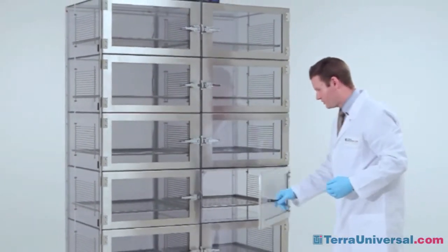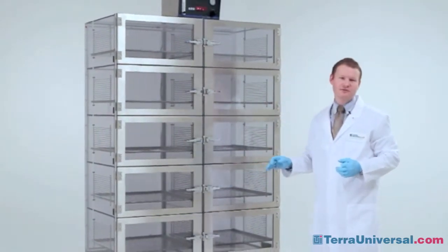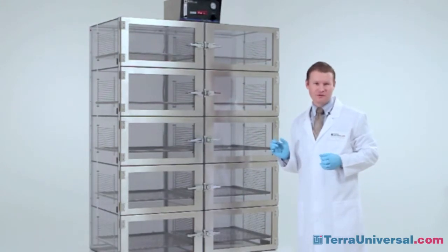Each of Terra's doors will include a door sensor that allows the dual purge system to regulate the flow of nitrogen to compensate for one of the doors being opened.